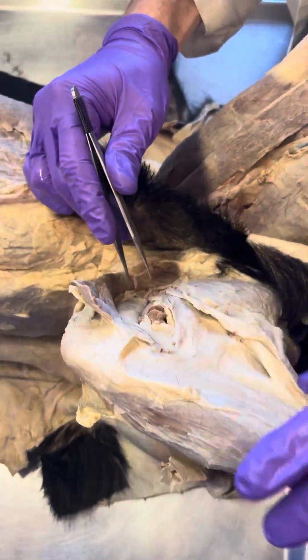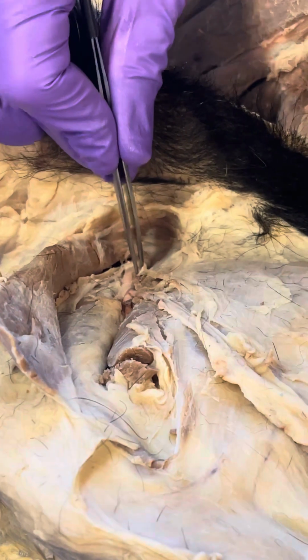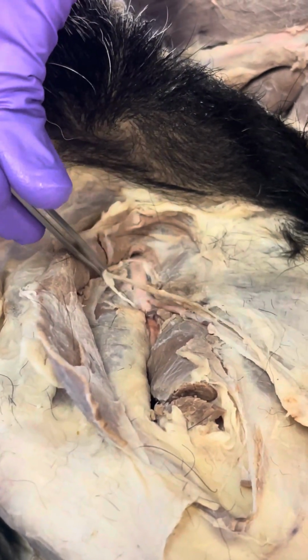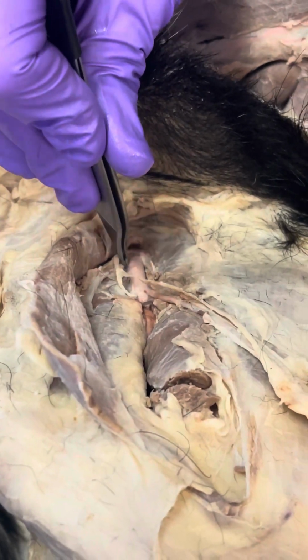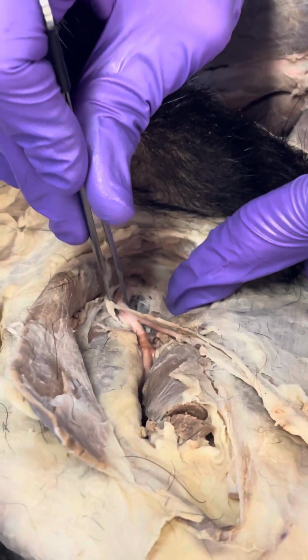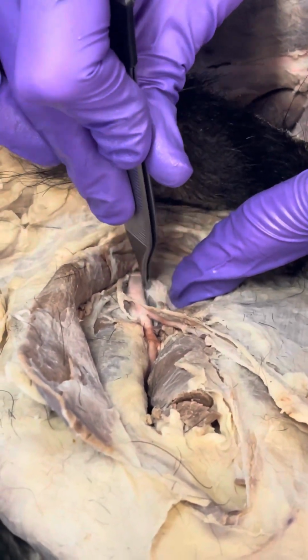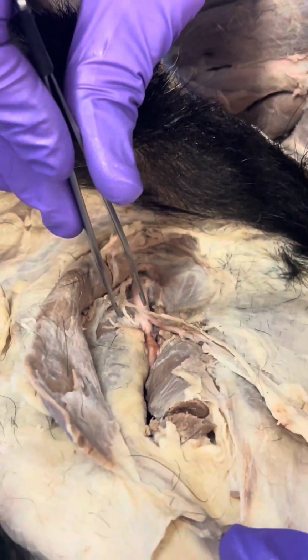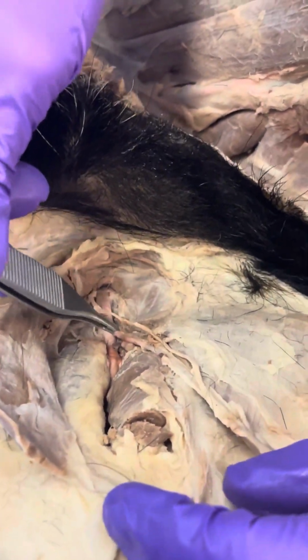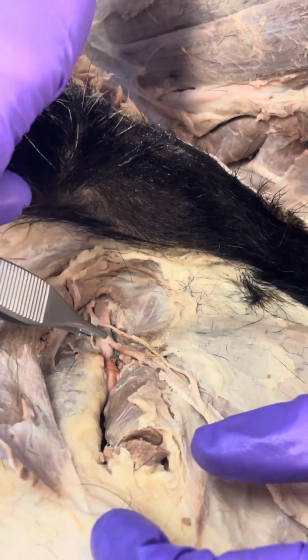Can everyone see this? So we have our saphenous nerve here, and our femoral artery. The vein's in there, but it's kind of deflated. The vein should be in here, okay? So remember, saphenous artery, vein, and nerve is a branch off the femoral.